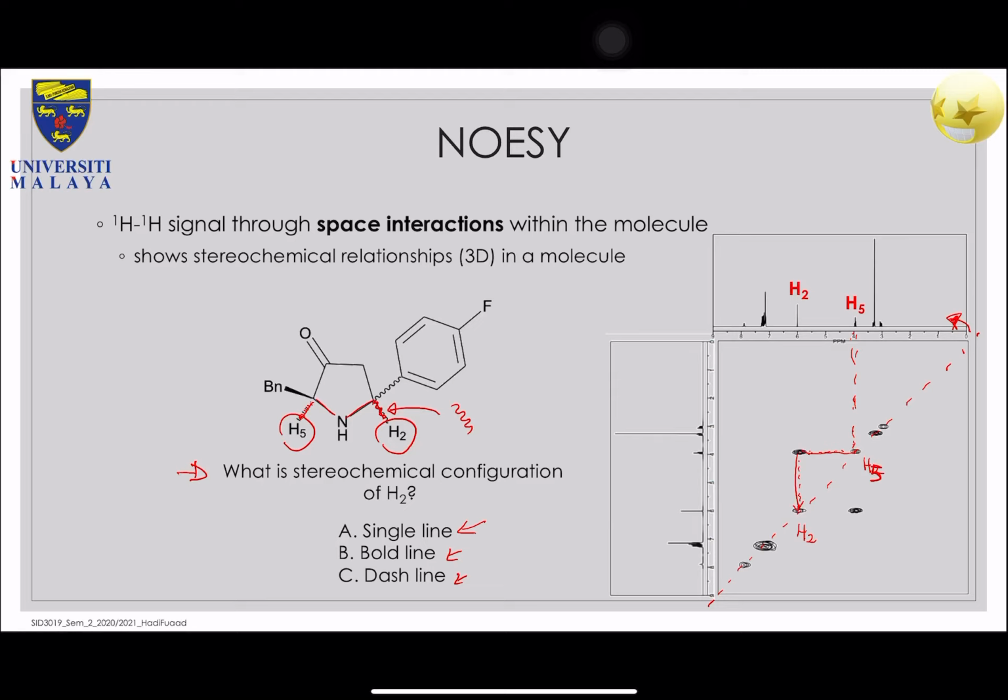So if you observe from this side, for example, where you have your NH over there, and then of course it's going at the back, you have your carbon over there. So imagine that this is now a piece of paper that you turn sideways.